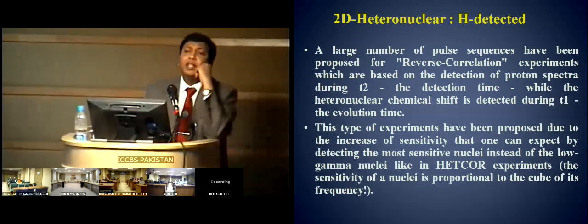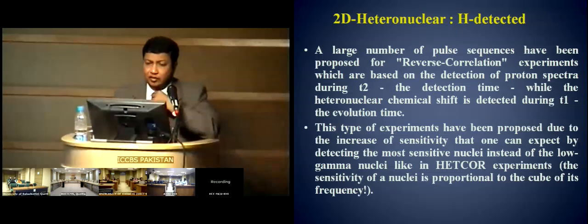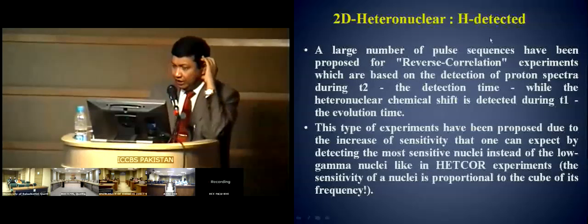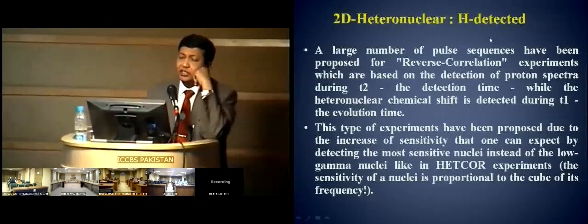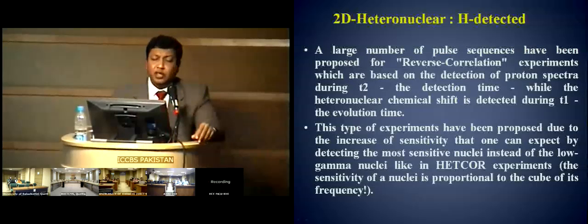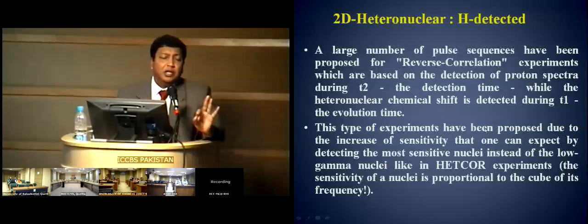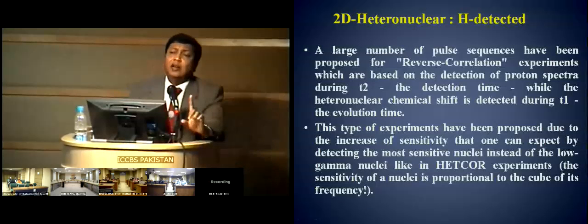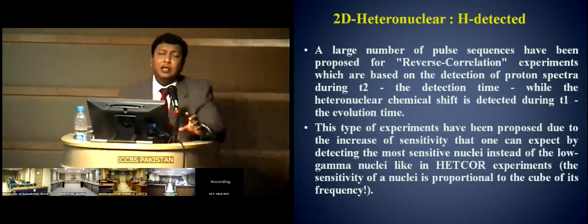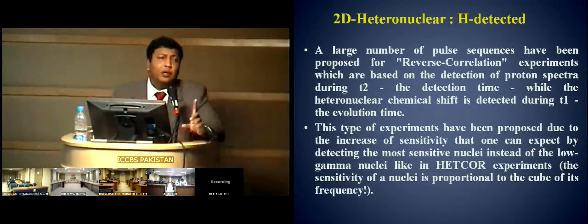Okay, then we start discussing a very interesting experiment which is called heteronuclear H-detected NMR spectroscopy, and I told you that this is one of the most important developments in NMR spectroscopy. We keep discussing that the most important driving force of development in NMR spectroscopy was initially the sensitivity.